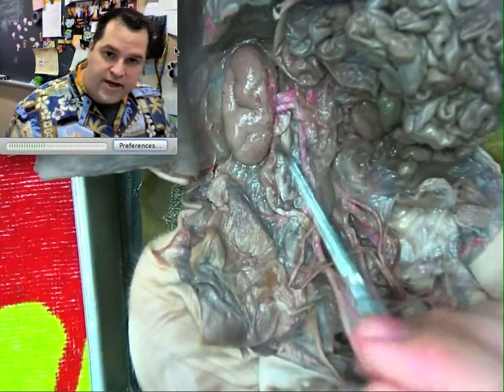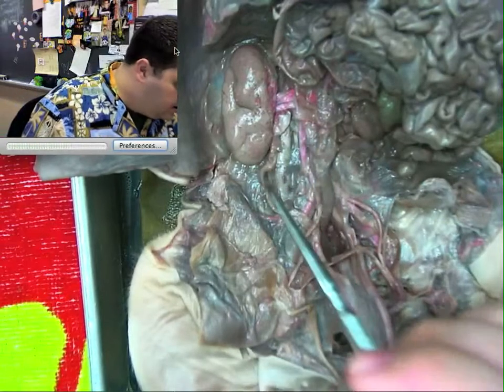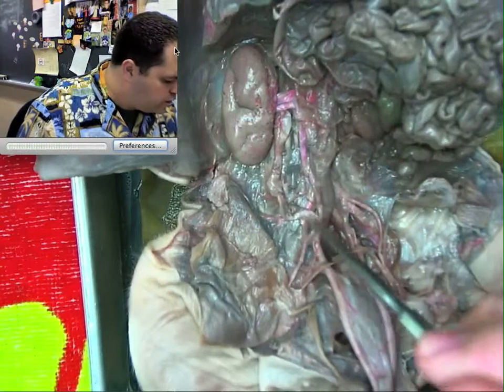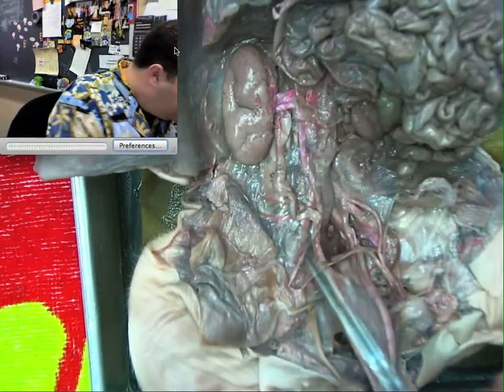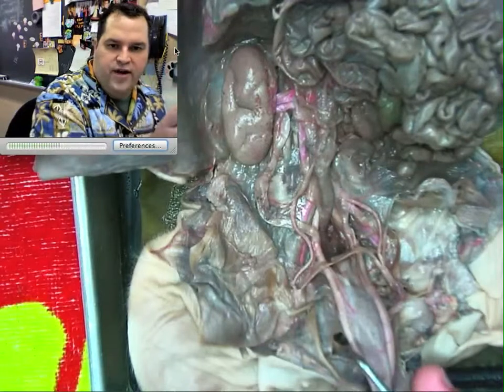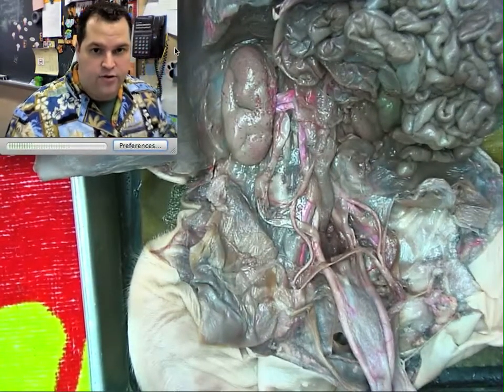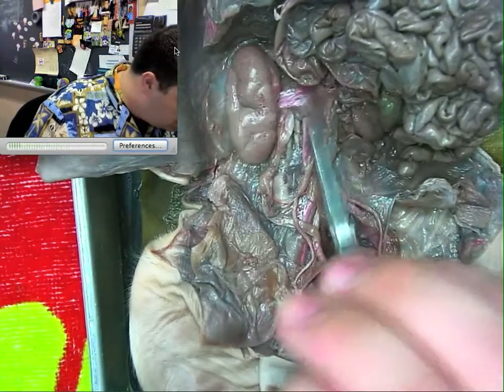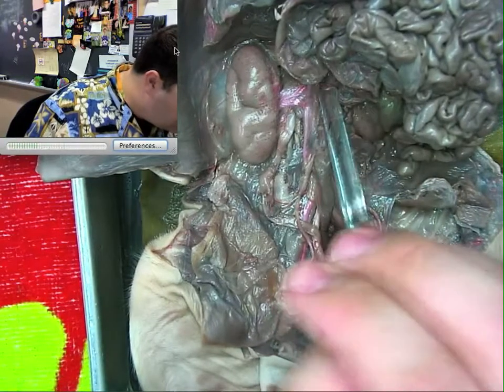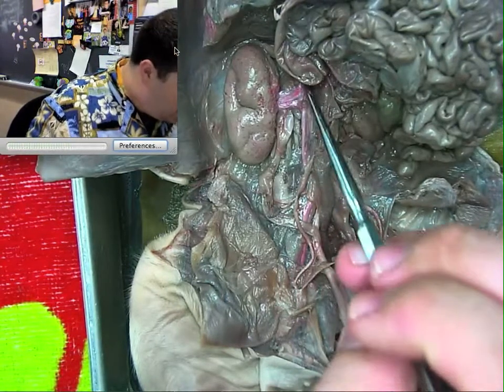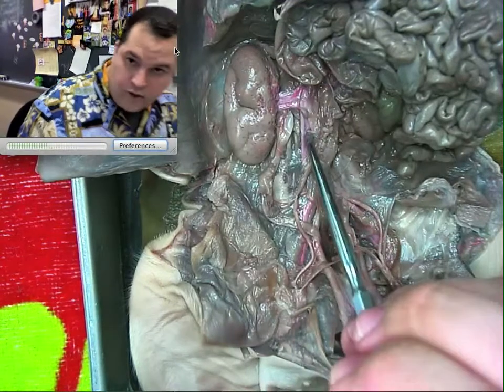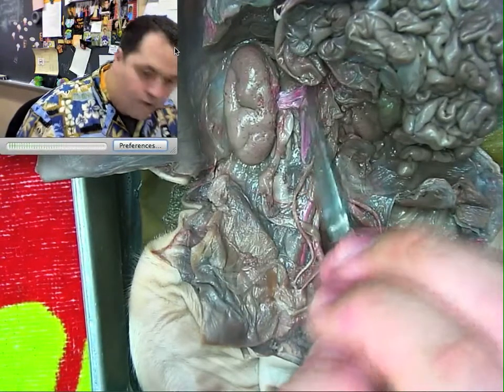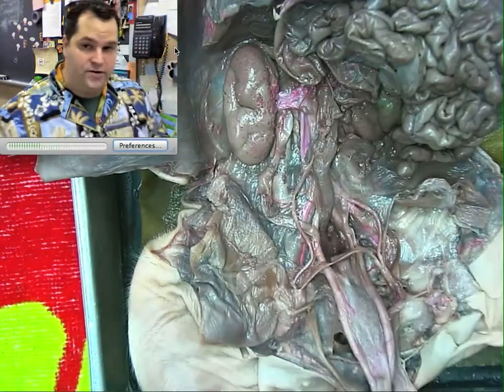There are three distinct entry points into the kidney. The long tube-like structure going all the way down is the ureter — we know that because it goes right into the urinary bladder. We also have a muscular round structure and a flat structure. Eeking away at the tissue, we notice the large flat structure attaches to an even larger flat structure — that would be the renal vein. This large vein running along the median line is the inferior vena cava. That makes the other blood vessel, by default, the renal artery.